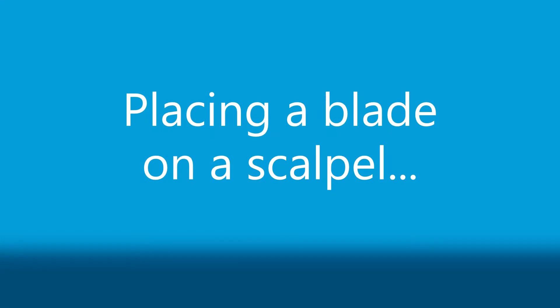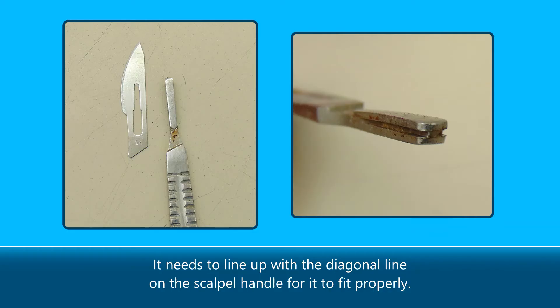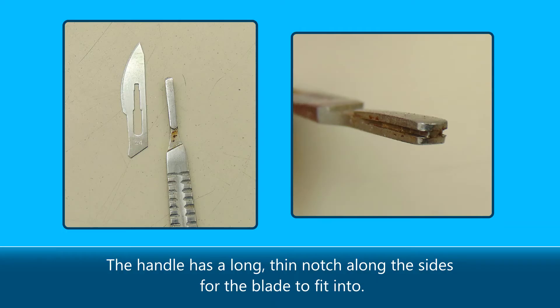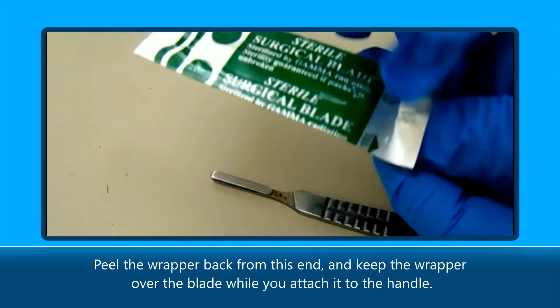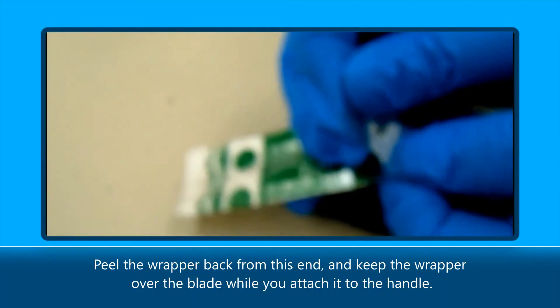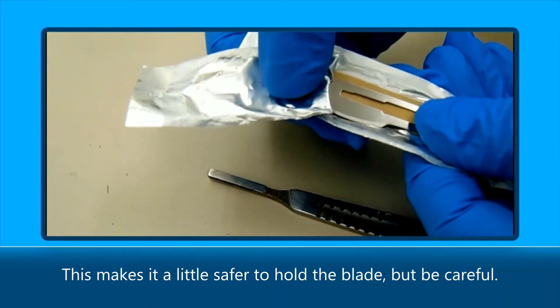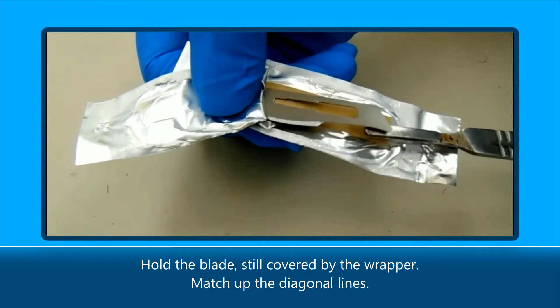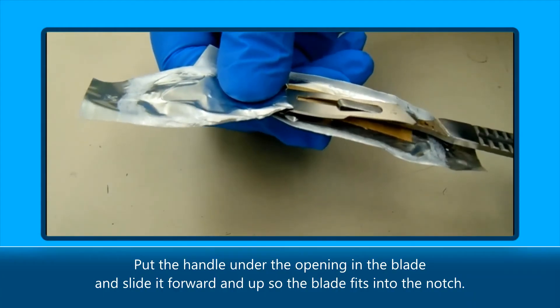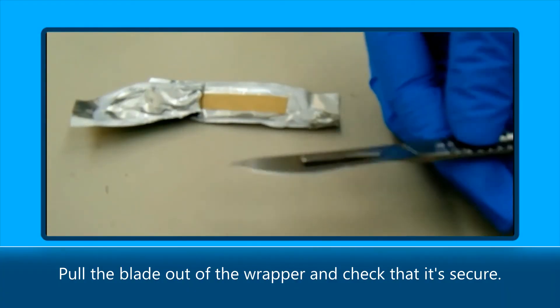Placing a blade on a scalpel: notice the diagonal edge at the bottom of the blade — it needs to line up with the diagonal line on the scalpel handle for it to fit properly. The handle has a long, thin notch along the sides for the blade to fit into. The blades come in foil packages with cardboard strips to keep them from cutting through. Peel the wrapper back from this end and keep the wrapper over the blade while you attach it to the handle. This makes it a little safer to hold the blade, but be careful. Hold the blade still covered by the wrapper, match up the diagonal lines, put the handle under the opening in the blade and slide it forward and up so the blade fits into the notch. Pull the blade out of the wrapper and check that it's secure.